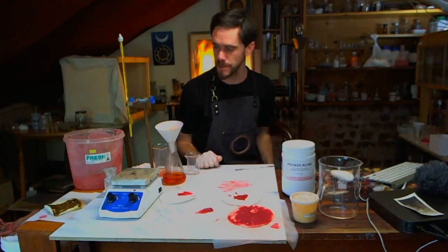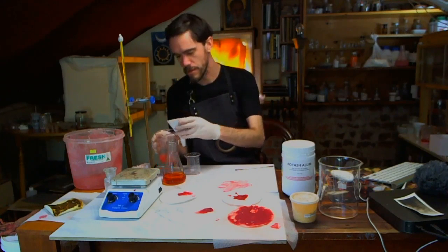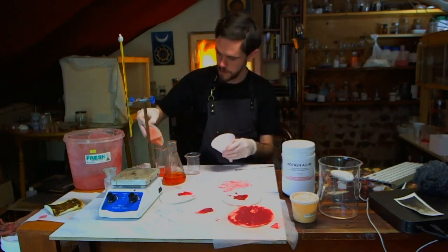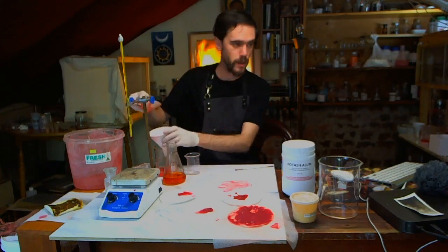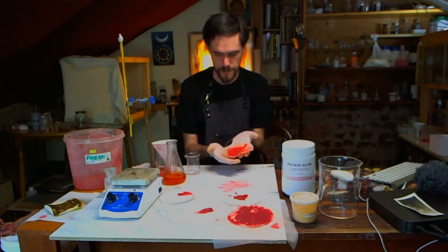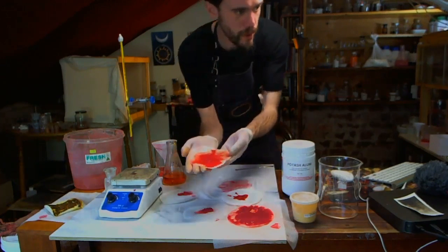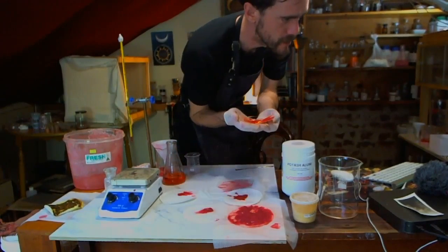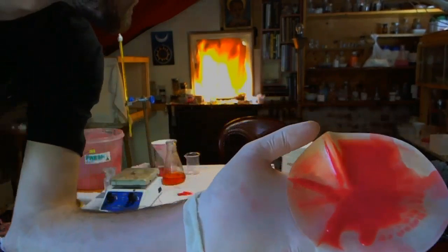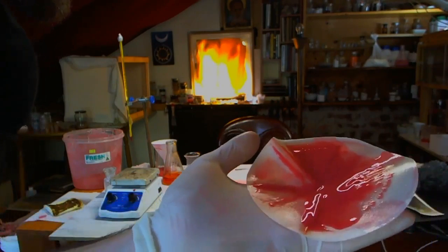All right, well, let's have a quick look at this one, too. This is what we got out of when we boiled that solution there. It's also really pure color. That's not showing up very correctly though. So it's quite pink, but it's quite clean in color.